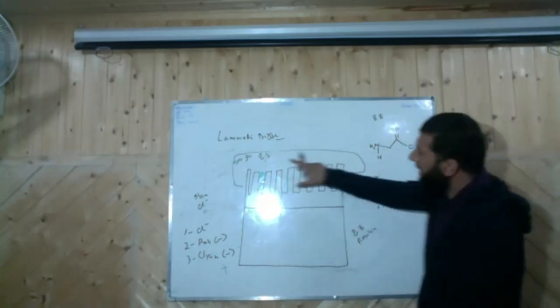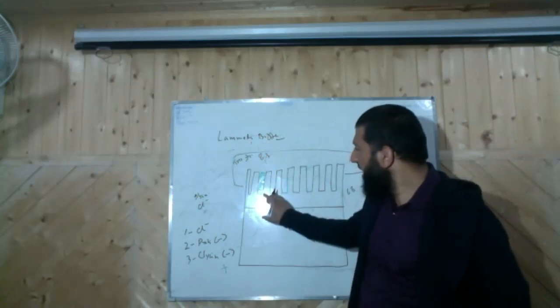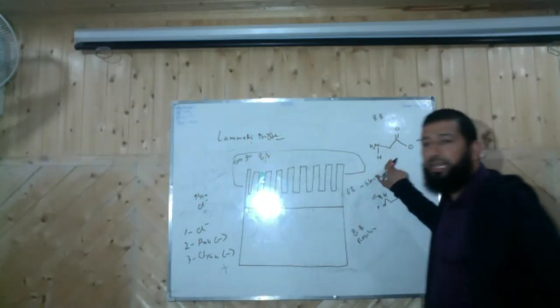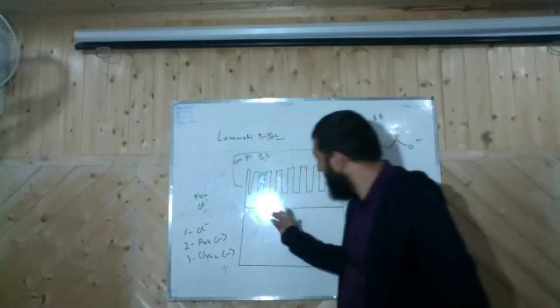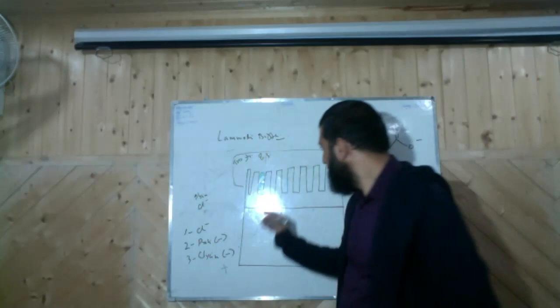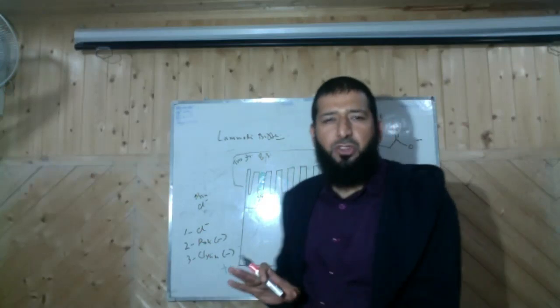So at pH 8.3, that's in the buffer. When we run the gel, these glycine ions start to move into the gel. Okay, but once they are in the gel, their mobility decreases because now there's a change in the pH. The pH is 6.8, and at lower pH, the negativity of glycine ions decreases. So they are dragged back. Okay. So chloride ions are faster. So you have chloride ions here. Okay. And then you have your protein, and then you have glycine ions. Now, chloride ions are also not that fast at this lower pH.